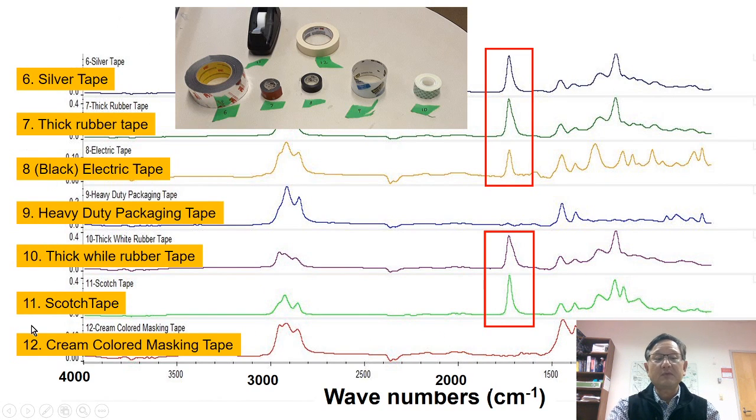If I go to the other samples shown here, IR spectrum was measured as a function of wave numbers, and different wave numbers show the different motions of molecules. We find that at 1,700, samples 6, 7, and 8, which are silver tape, thick rubber tape, and electric tape, have these peaks. Also, the scotch tape and thick white rubber tape show the peak. Whereas, this packing tape and cream-colored masking tape do not show. So they are chemically different from the others.